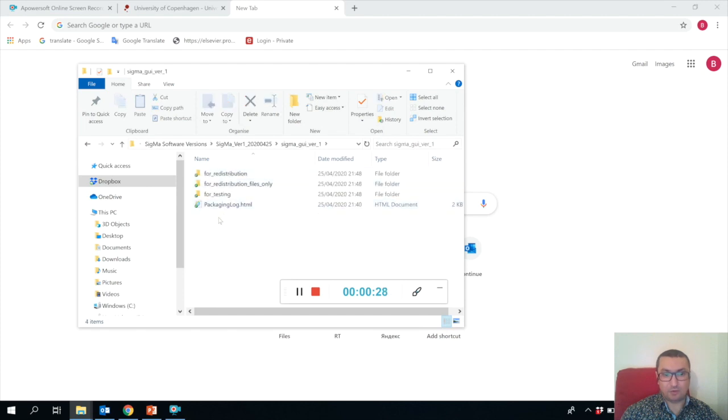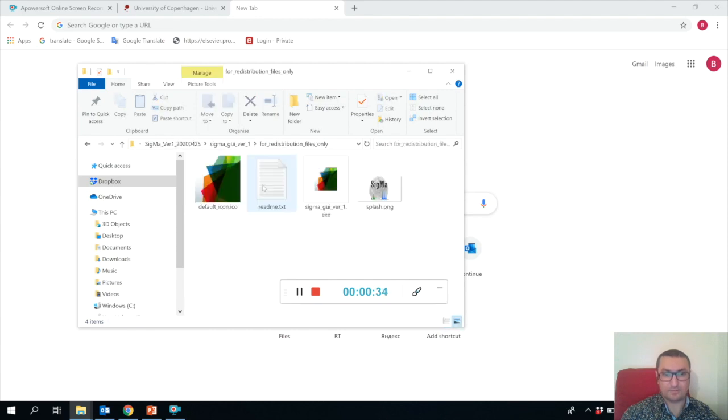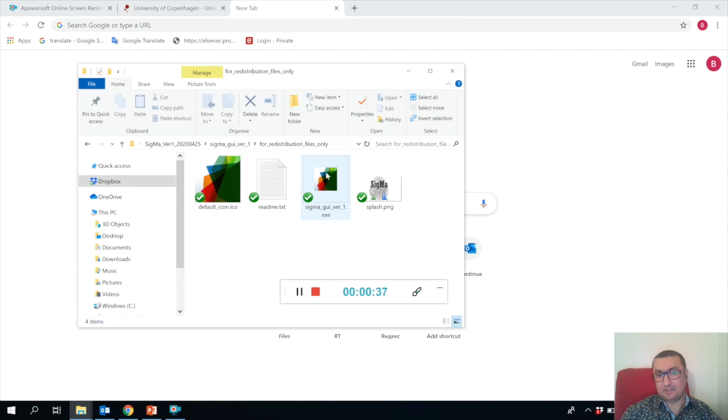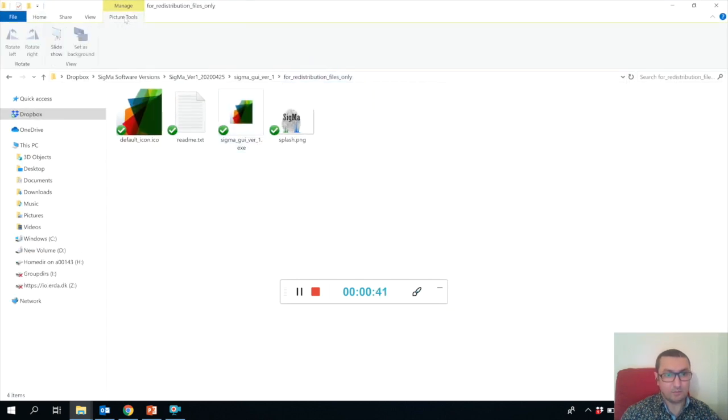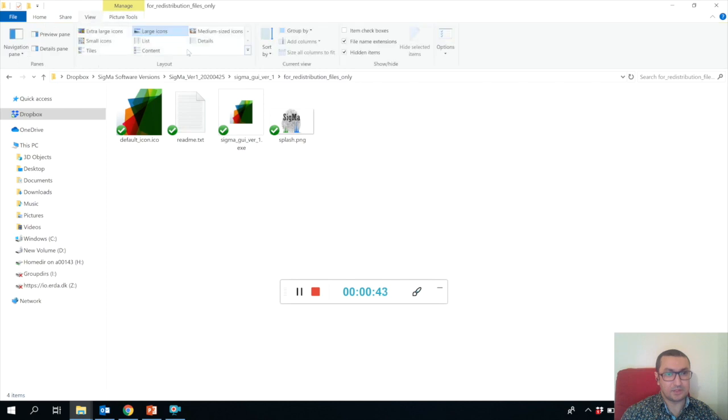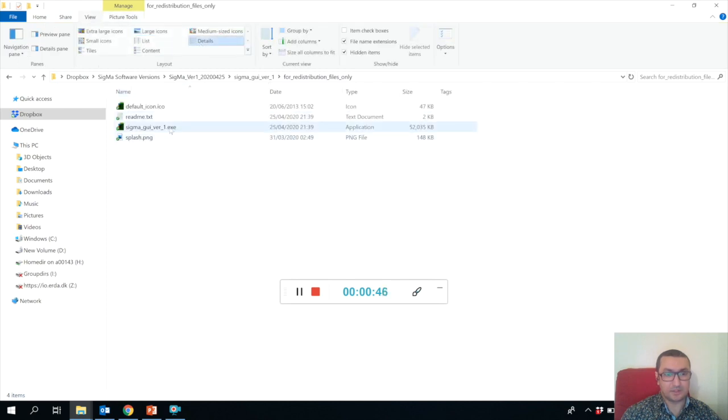There will be three folders. Please just go to the folder called 'For Distribution Files Only' and there you will see a Sigma exe file. What you need to do is execute the exe file.